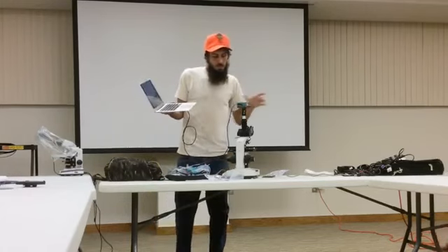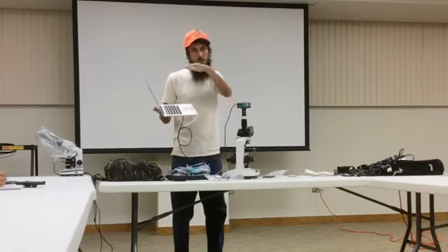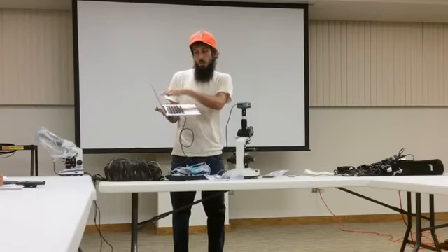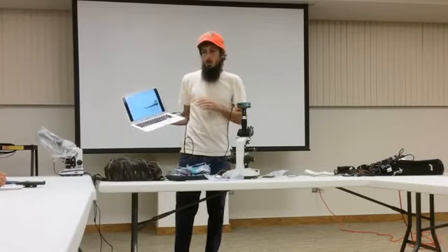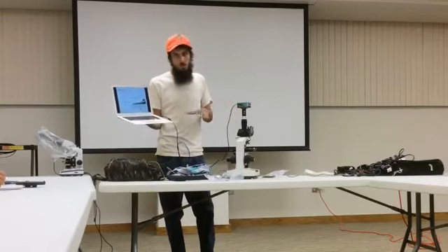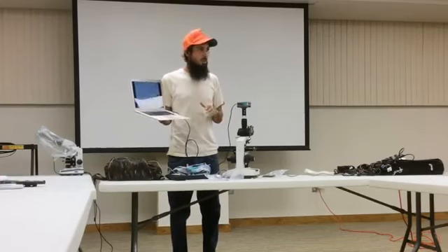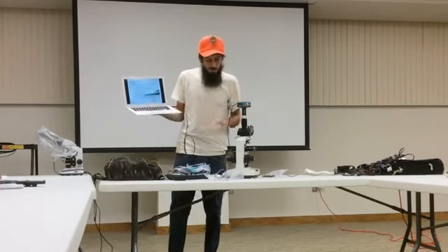So for every slide, I should see one nematode, but for every place I move the microscope and move that slide around, I should see one fungus. So there's a lot of different funguses I should see on this slide for it to be in the balance. And I should also see some active bacteria. A lot of times I look at it and it's just all dead and nothing's moving around. But in a healthy soil, I should see some things wiggling around and moving and interacting. So those are the main things I have here.